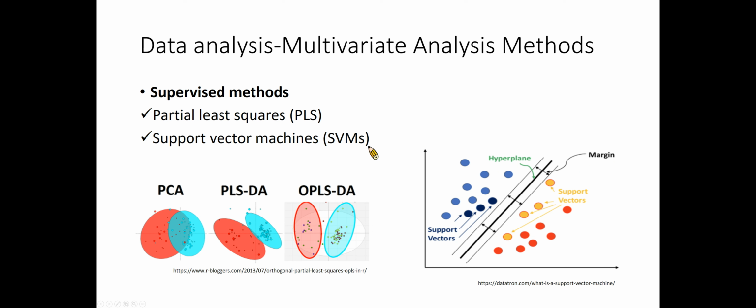In unsupervised analysis methods, the similarity patterns within the data are identified without taking into account the type or class of the study samples. In supervised methods, the sample labels are used in order to identify those features or feature combinations that are more associated with a phenotype of interest.